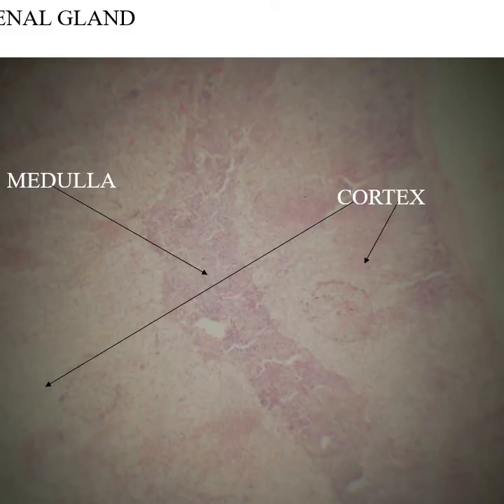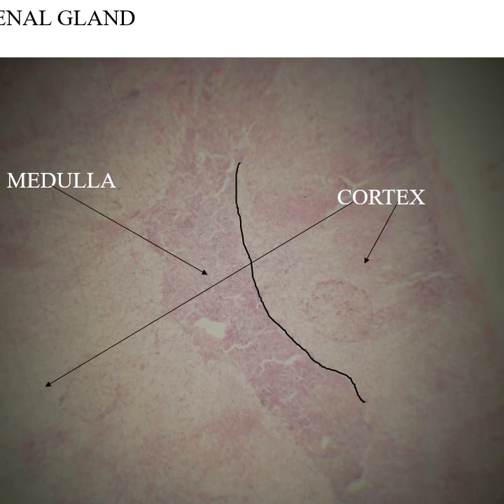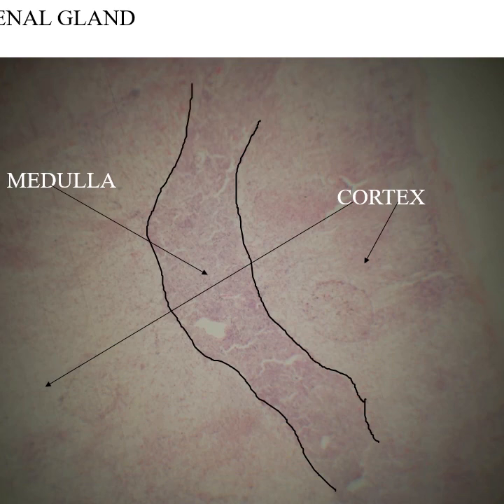All right, this is the adrenal gland. Now, I usually go into a little more detail with the adrenal gland, but because of what's up this semester, I am not. But what you'll notice on this one, I don't even think this one's in your box anymore. I think this is a kind of a poor section through a human adrenal gland.